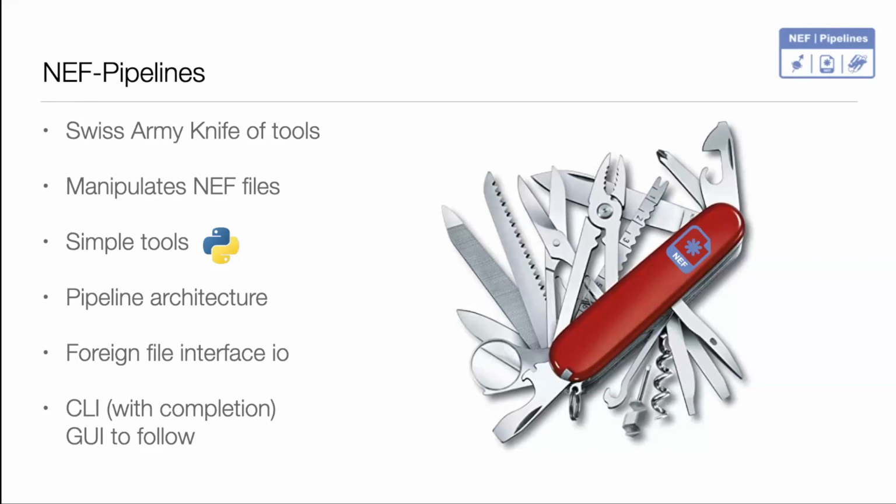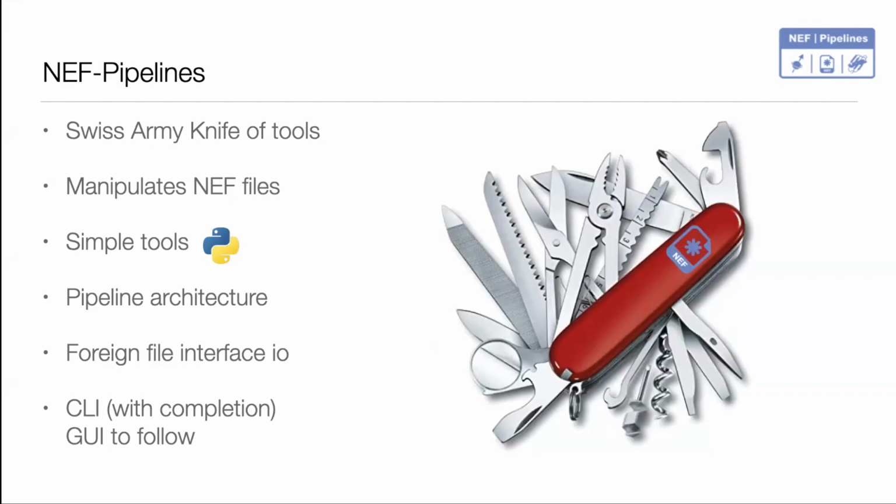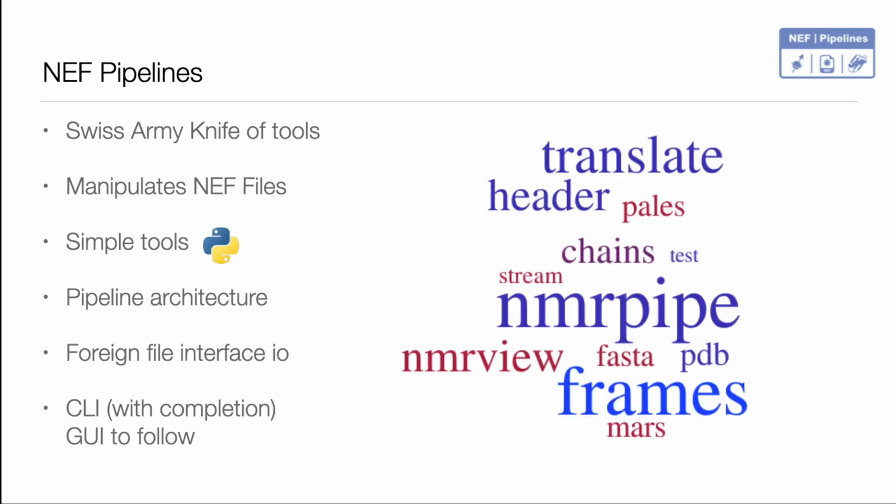As the image may suggest, it's designed to be a bit of a Swiss Army knife of tools to work with NEF files. NEF files are reasonably complicated and structured inside. I don't know whether Eliza's done her warning already about whether you should or shouldn't edit NEF files, but to get them right, there's quite a lot you have to do. So this set of tools is designed to help you. It's designed as a set of simple tools written in Python. And these are examples of the sort of tools that are in there.